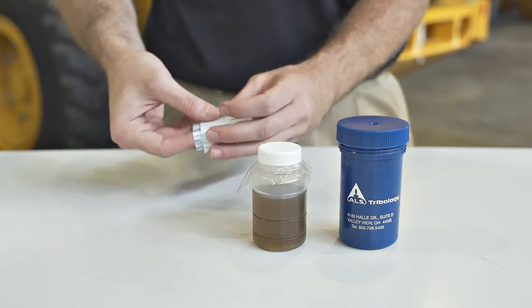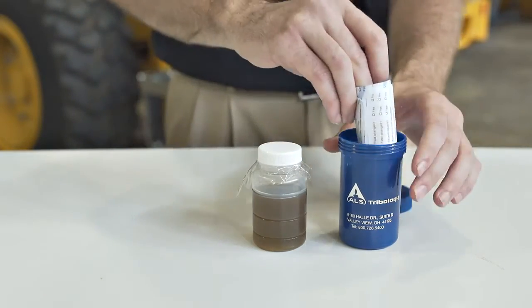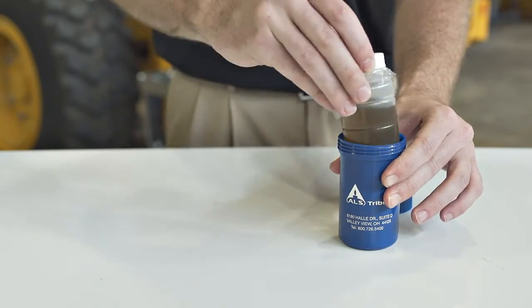If the equipment has not been sampled in the past, complete all equipment information such as description, make and model, and location.